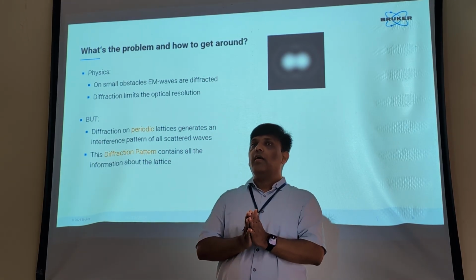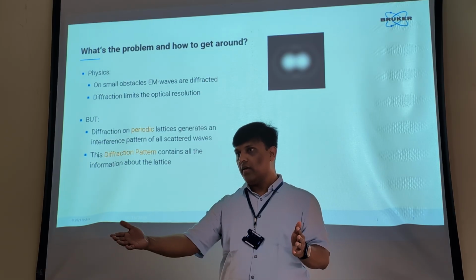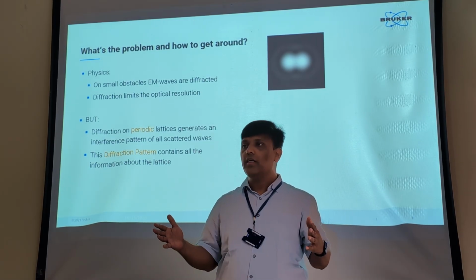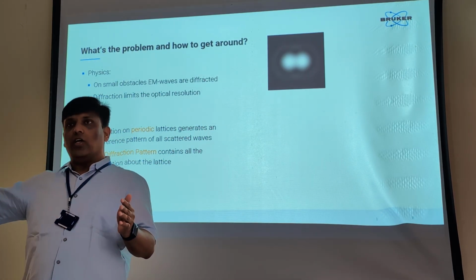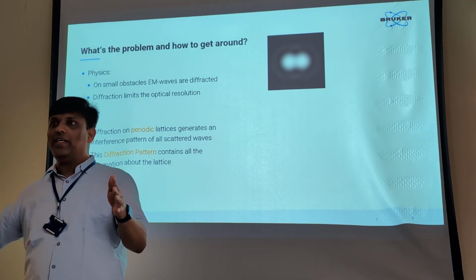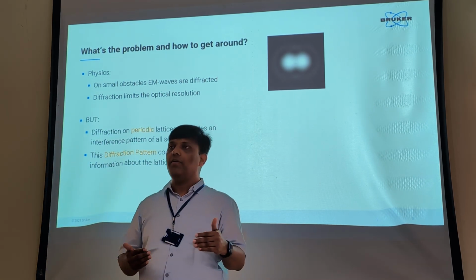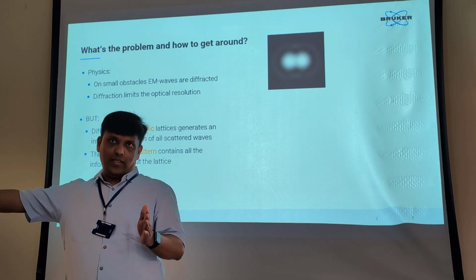The difference between a regular polycrystalline sample and a single crystal is that in a polycrystalline material, you don't have a long-range order. There is no periodicity till infinity; it lasts only for some time. It has a short-range order. But a single crystal has a periodicity.